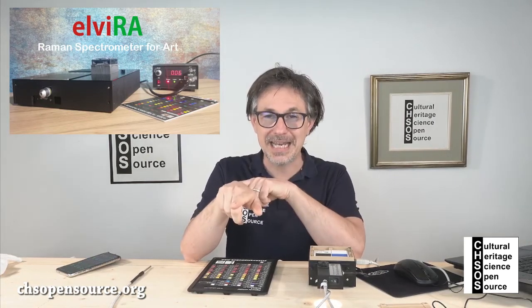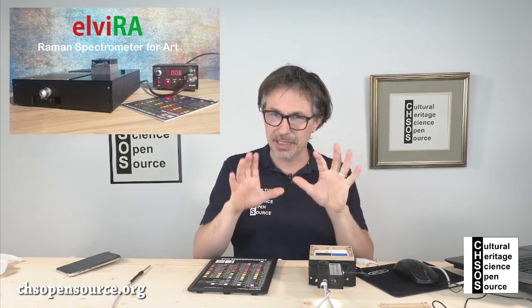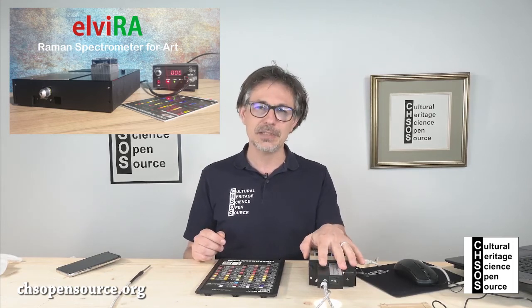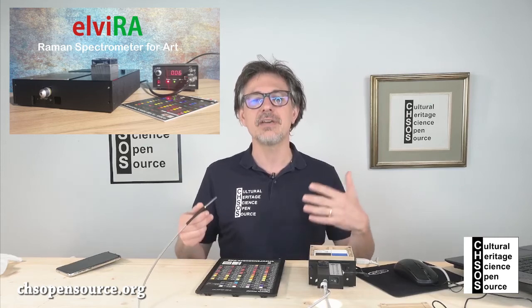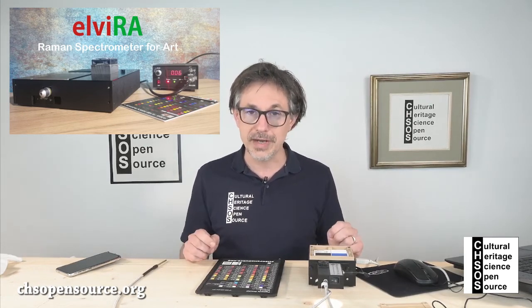And so basically we can tell that the object was made in the early decades of the 20th century. This analysis was also confirmed using Raman spectroscopy, the Elvira system, because anatase and rutile have different Raman spectra, so they can also be distinguished by this technique. Though the advantage of using Gorgias reflectance spectroscopy is very important, because the acquisition is very fast, easy, and the equipment is lightweight to bring around.